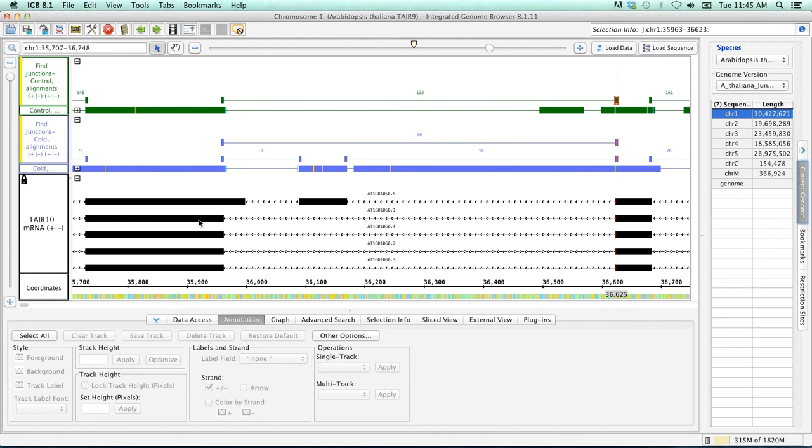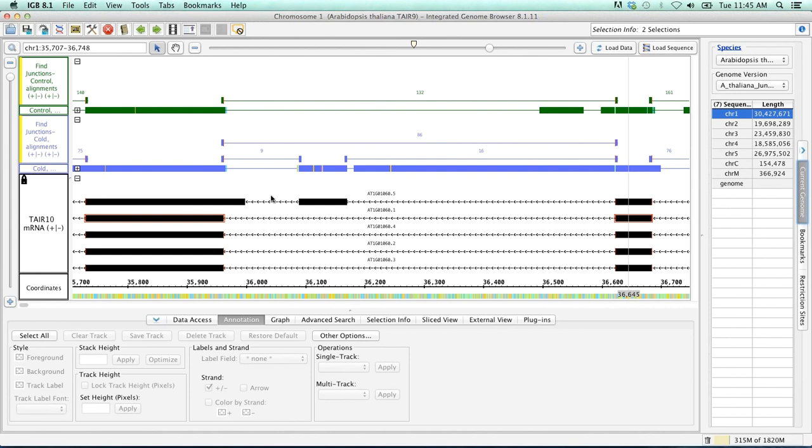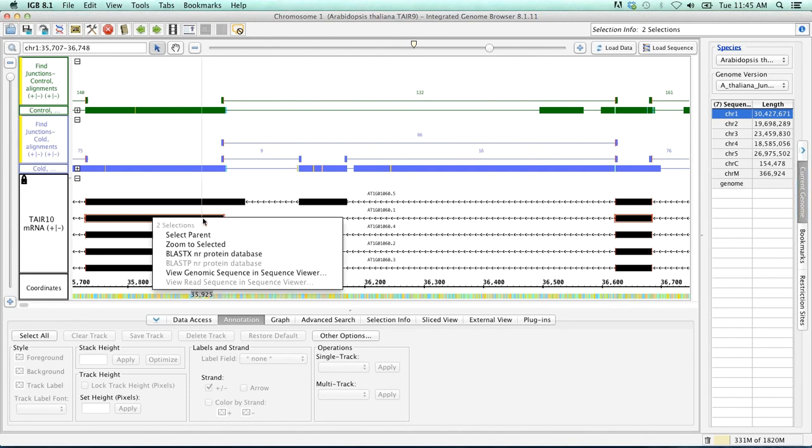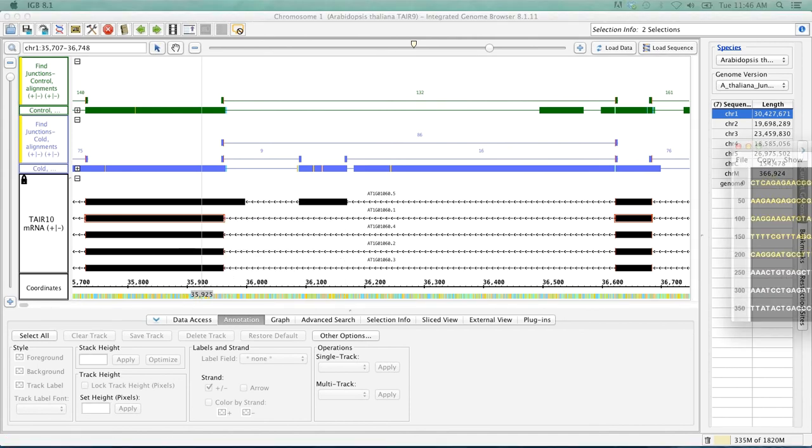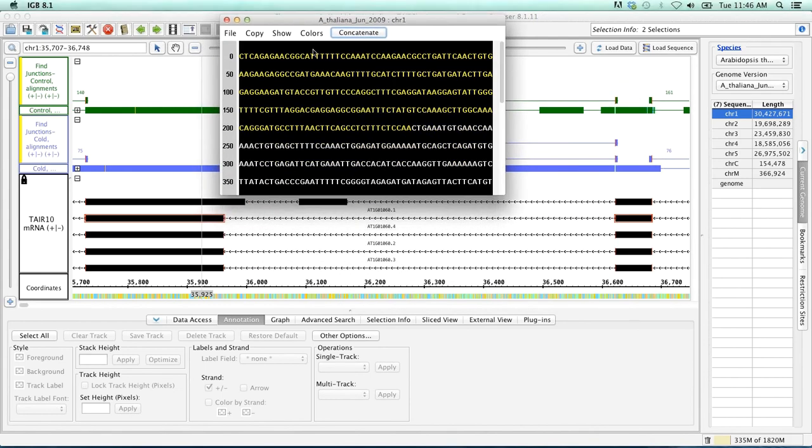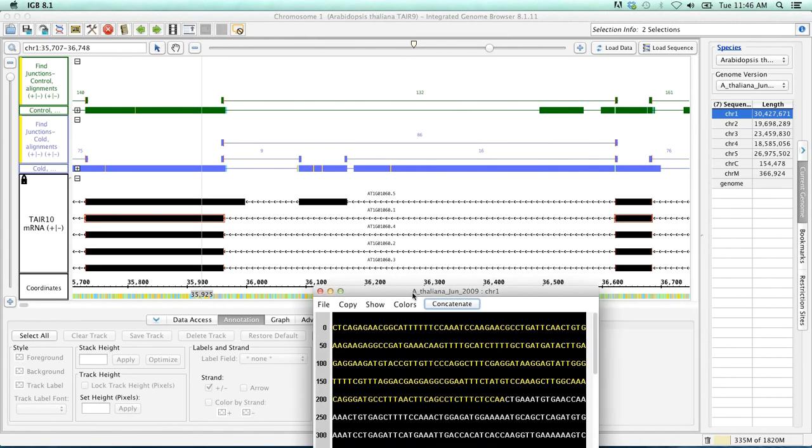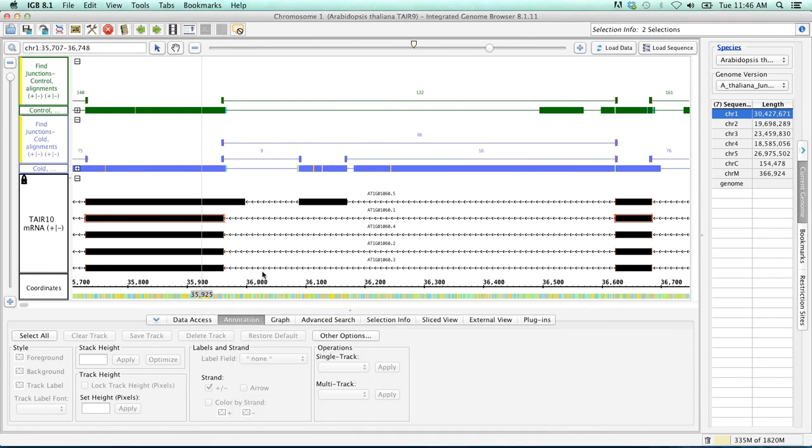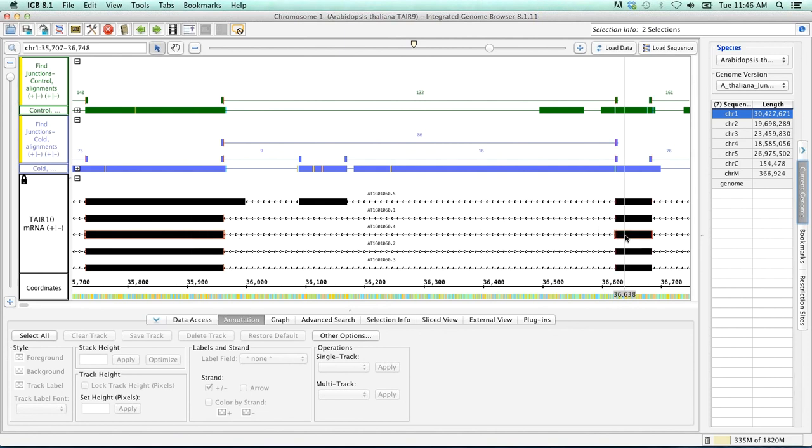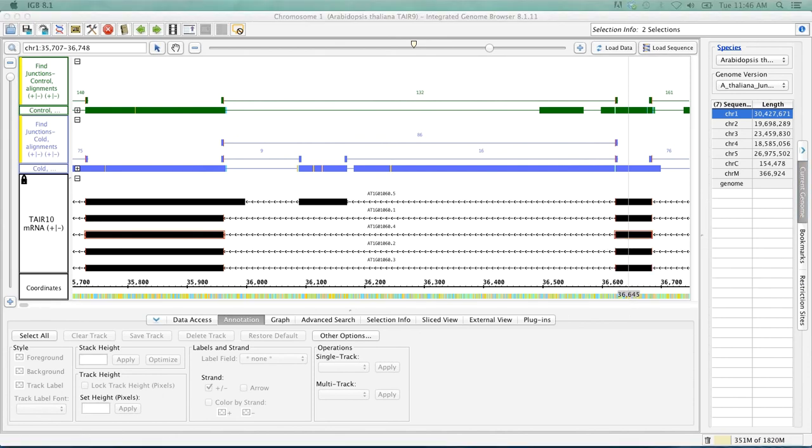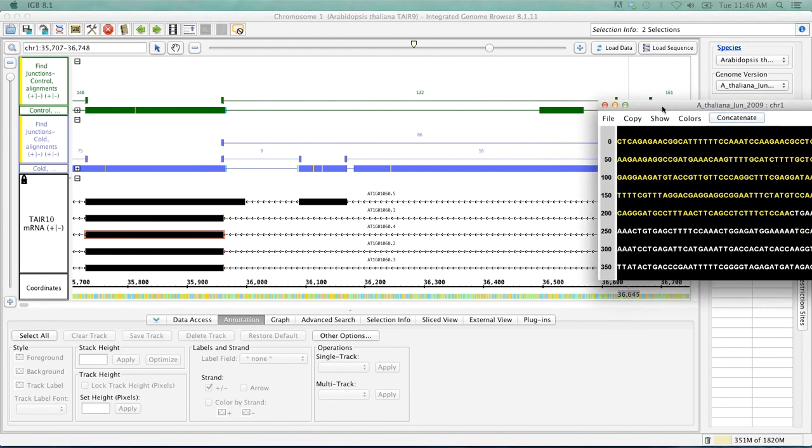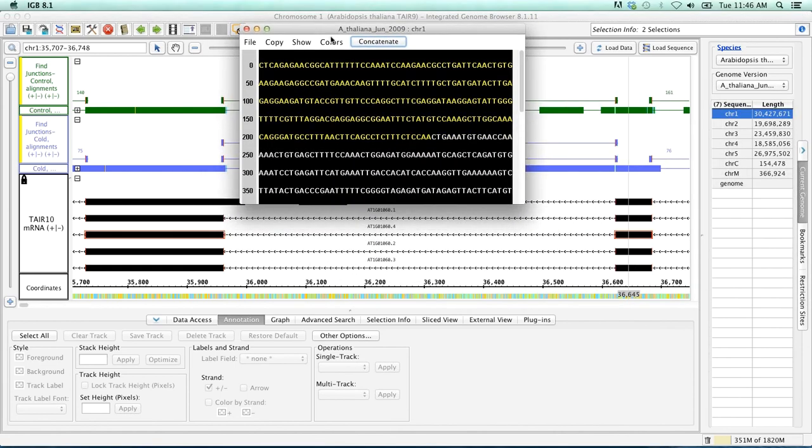So in order to do this, let's start off by clicking on our gene model here. Then I'm going to shift-click and click on the opposing flanking exon. So we're surrounding our exon here. Then I'm going to right-click and view genomic sequence. So that was shift-click on the flanking exon here. And then I'm going to shift-click on this other flanking exon on the other side. And then right-click and view genomic sequence in sequence viewer.